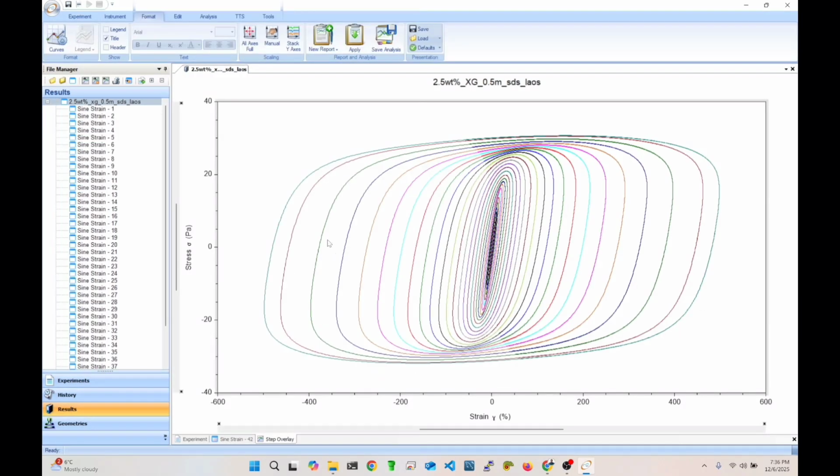So these are all the oscillations. It plotted everything from the smallest strain amplitude in percent up to the largest. You can see this is 600, so probably this is 500. The strain sweep began at some small amplitude up to 500%. So that's why you have this. Depending on your rheometer type, you might have a similar thing, but OSR-Tool can handle all kinds of data, both computationally generated data, like using some model, or experimental data. But I would like you to see what is in this file.